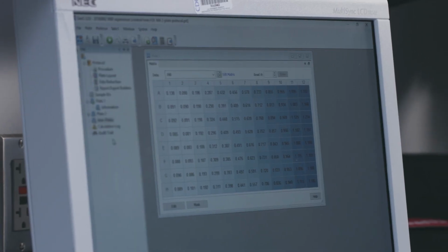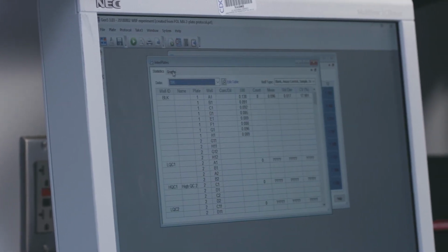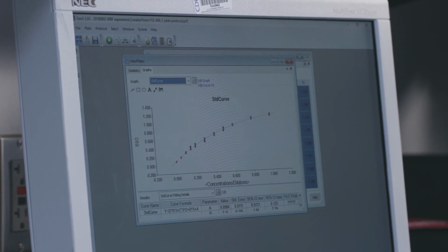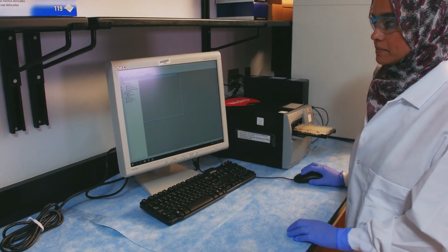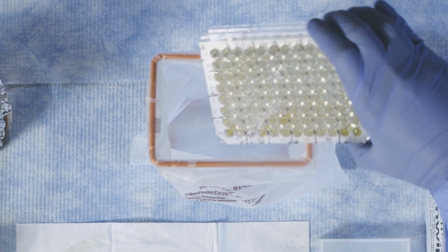Handle all plates consistently. Review the calibration curve and QC results, and the imprecision of the 4 replicate results for the unknown samples following the data review SOP. Generate Power export results and save the file. Remember to discard the plates into a biohazard autoclave bag.